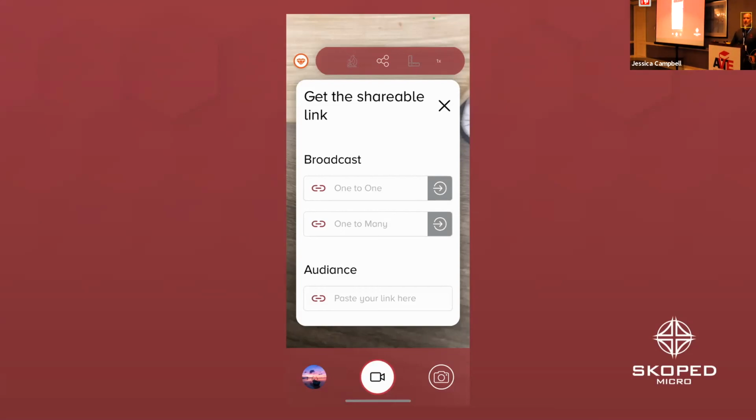You can take pictures and videos with it. So you could always take a picture or video and use that in a slideshow or show people or prove it, but it's not working right now through our broadcast. So that's good to know. This is the first time we've done a one-to-many, so it may be a one-to-many issue, not just a one-person problem.